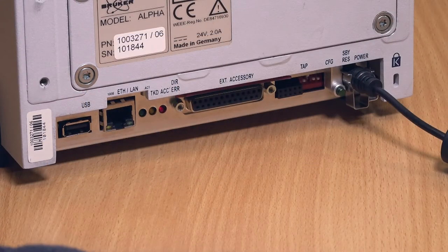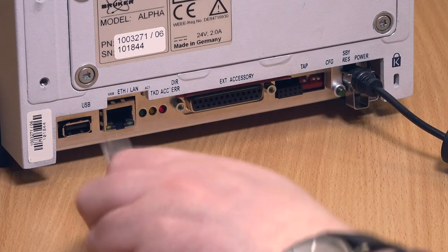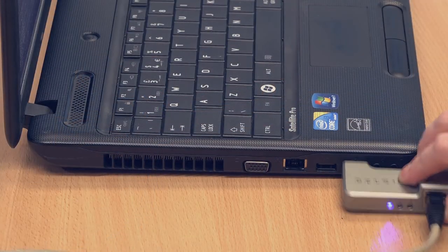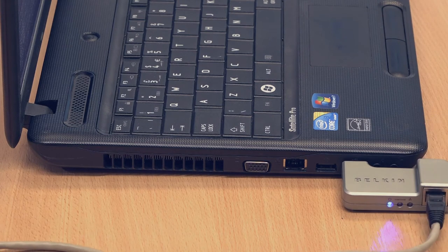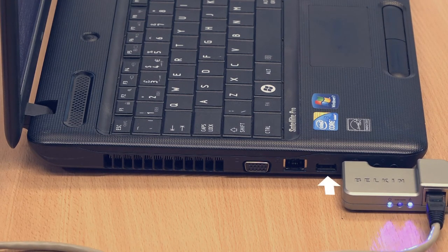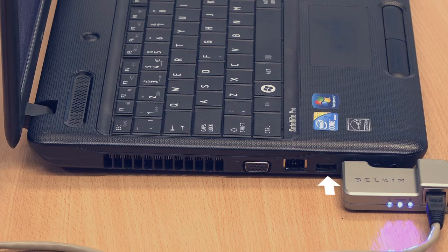Connect the ethernet cable to the rear of the spectrometer as shown, and the other end of the cable plus its adapter into the front USB port of the laptop. This ensures you can access the other USB port to plug in the mouse.